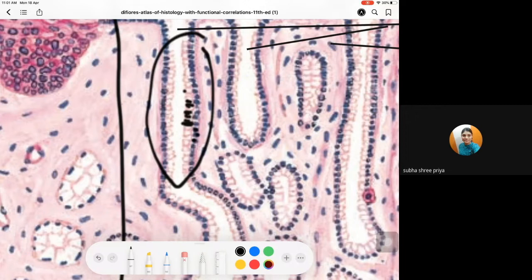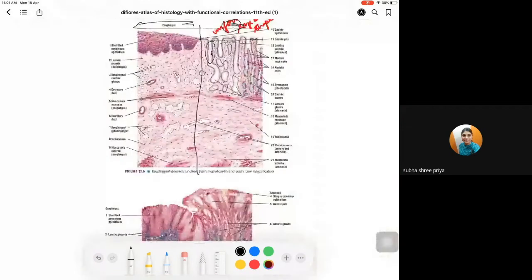Then it is gastric heterotopia or ectopic gastric gland in the duodenum. Small intestinal mucosa can come into the stomach, or the gastric mucosa can be seen in small intestine. That you have to remember. Then we call them metaplasia.